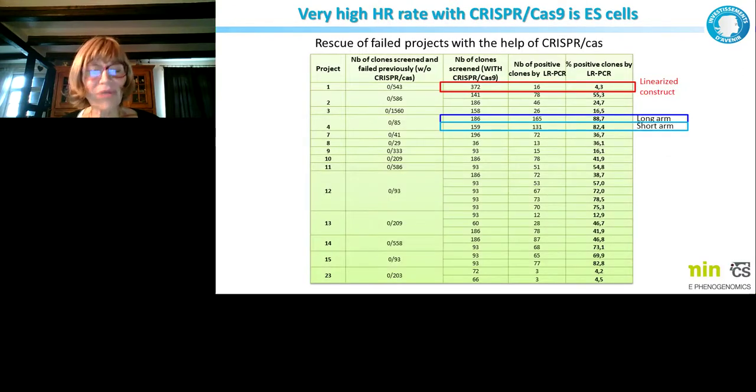And that's our data. That's just to show you all the projects numbered here, 1 to 23. Here you can see the number of clones that we analyzed first, and some of these projects are really old. When CRISPR came out, I thought, okay, we didn't manage to obtain one clone. For example, for project 3, we analyzed more than 1,500 clones without any positive clone.